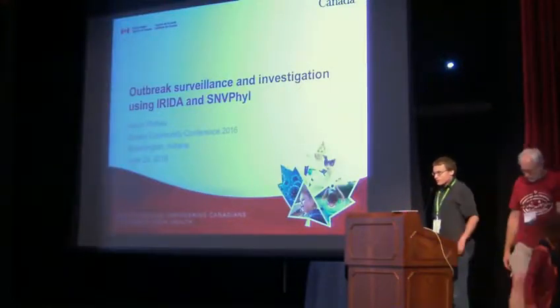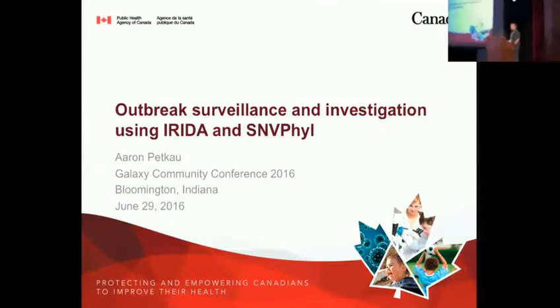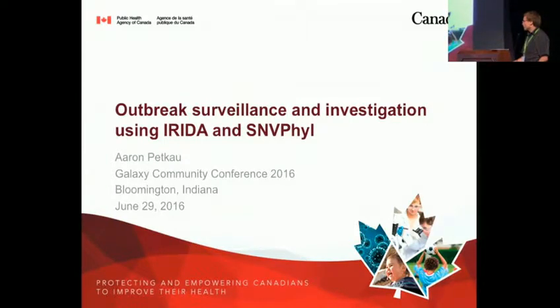Hello there. So I'm Aaron Petkau, and I work with the Public Health Agency of Canada over in Winnipeg at our large microbiology lab over there. And we've been using Galaxy for quite a number of years, both as a method of performing high throughput research, but also we've been developing software that sits on top of Galaxy and assists us in a few more automated ways that I'm going to describe right now with our project IRIDA and its pipeline in Galaxy called SNVPhyl.